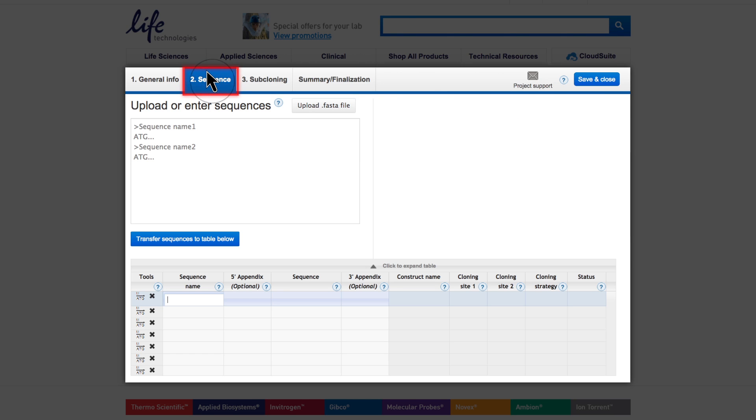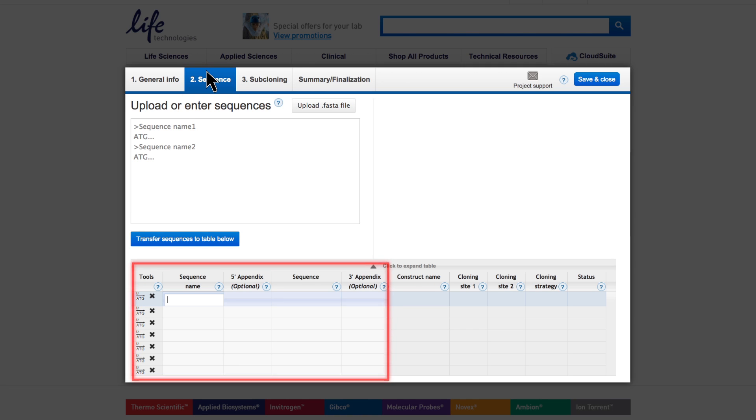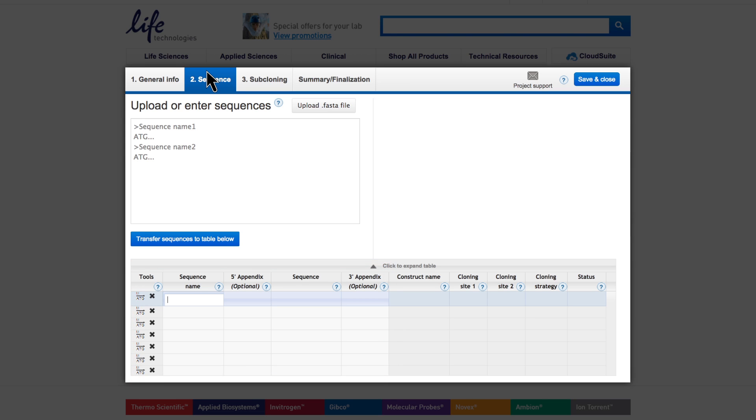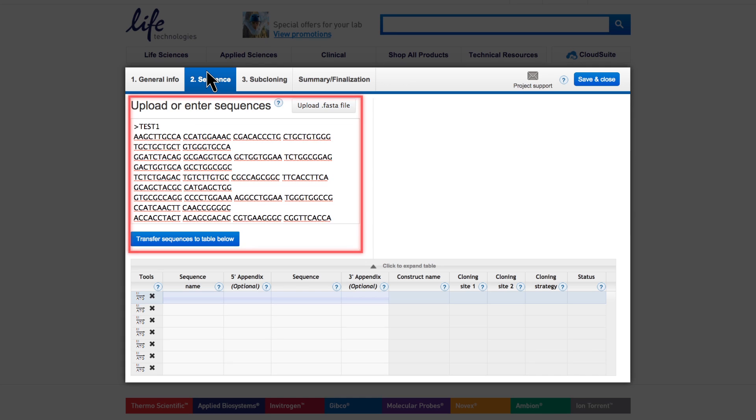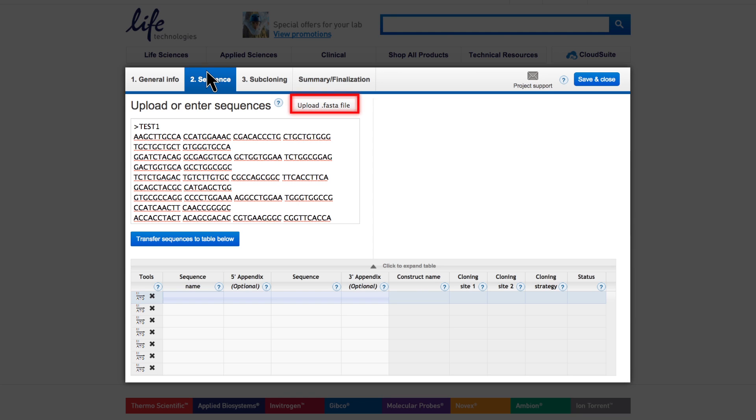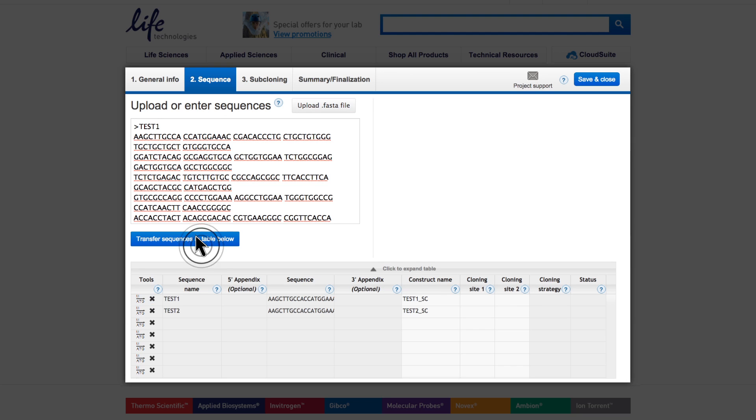Move to the Sequence tab to enter your sequences. Light color here indicates editable fields for your sequence input. You can paste or enter your sequence information directly or use the input window with sequence information in FASTA format. Alternatively, you can directly upload a FASTA file. Then push the Transfer Sequences to Table Below button. Now your sequence information will show up in the table.